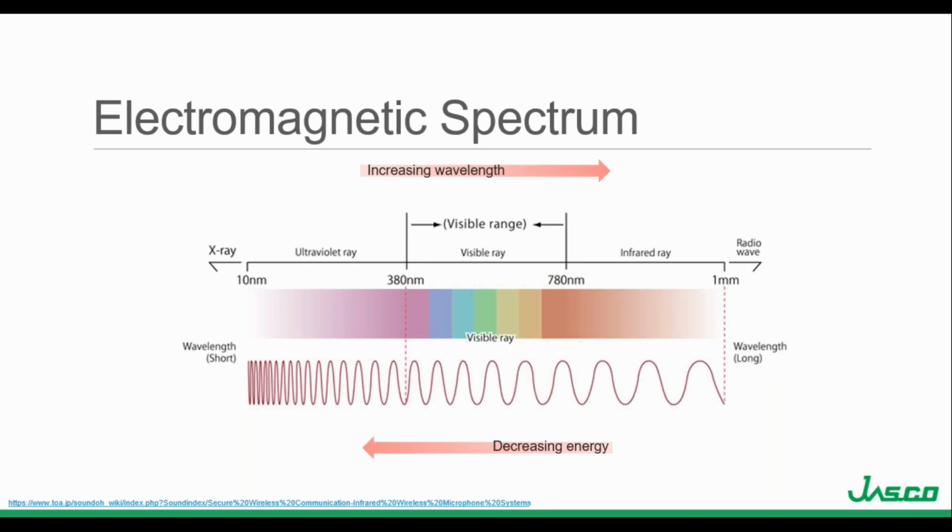UV-Vis near-infrared spectroscopy can be divided into the ultraviolet, visible, and near-infrared regions of the spectrum, depending on the wavelengths used. The ultraviolet region is typically measured from 180 to 400 nanometers, the visible is 400 to 800 nanometers, and the near-infrared is 800 to 3200 nanometers. The larger the wavelength, the less energy involved, so chromophores that absorb in the UV region of the spectrum require more energy than chromophores that absorb at, say, 700 nanometers.